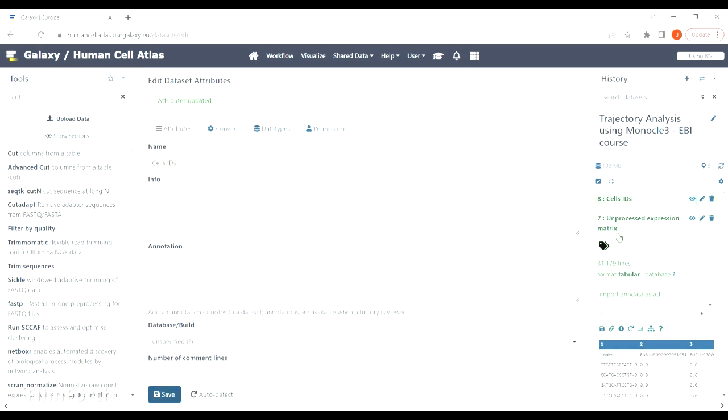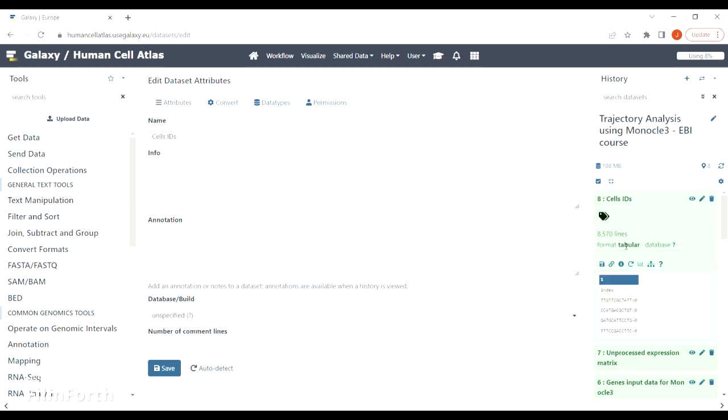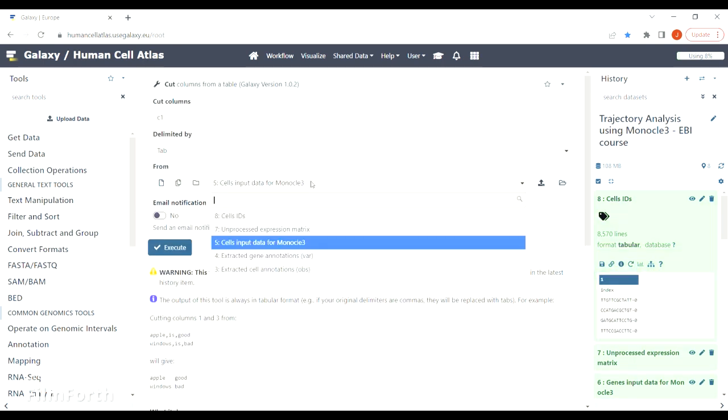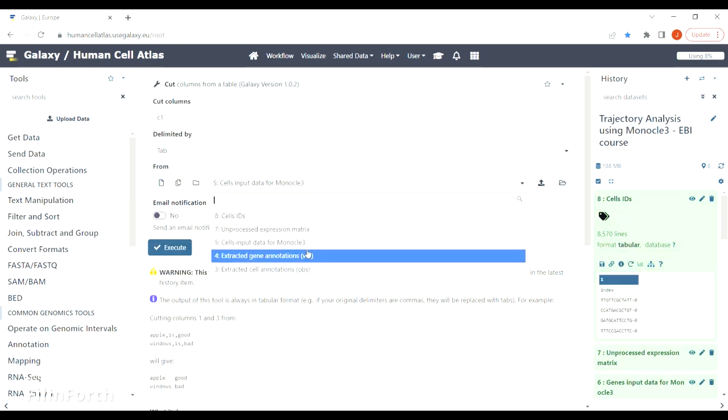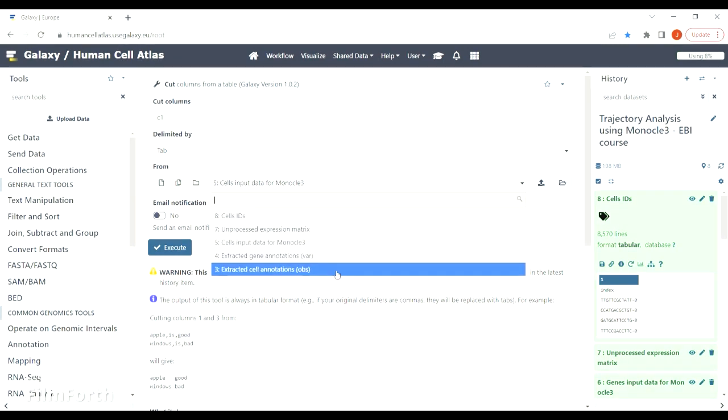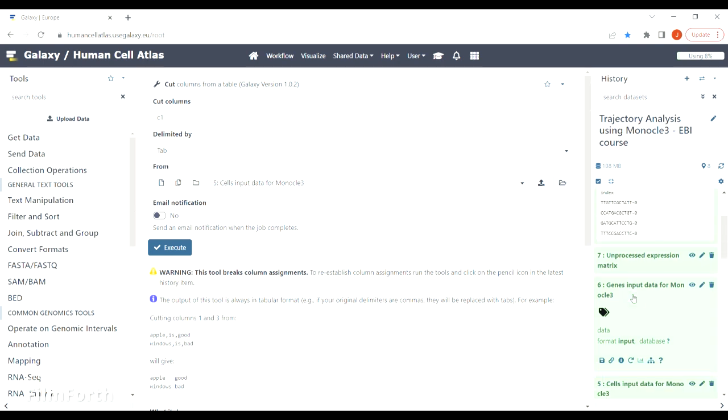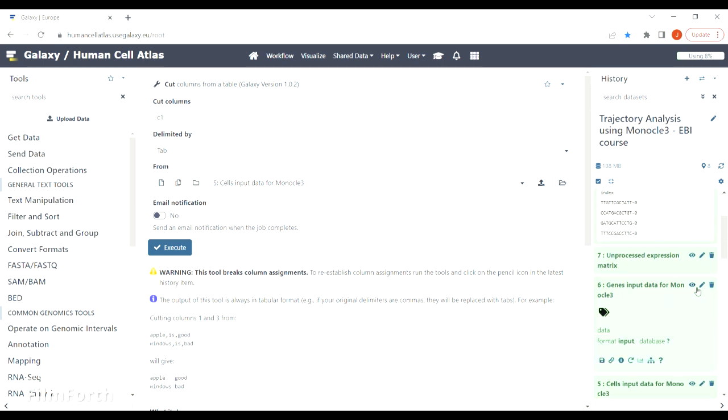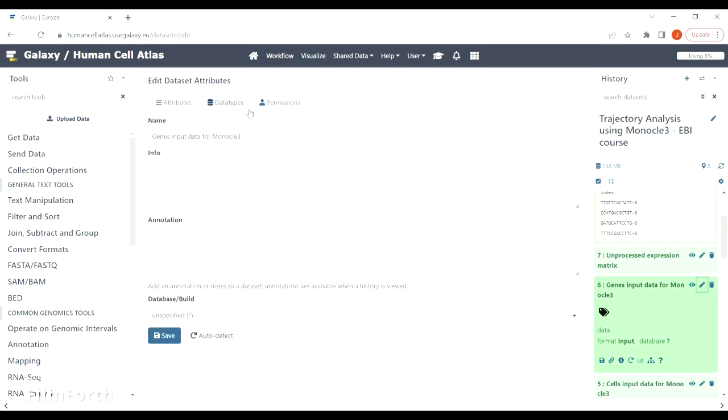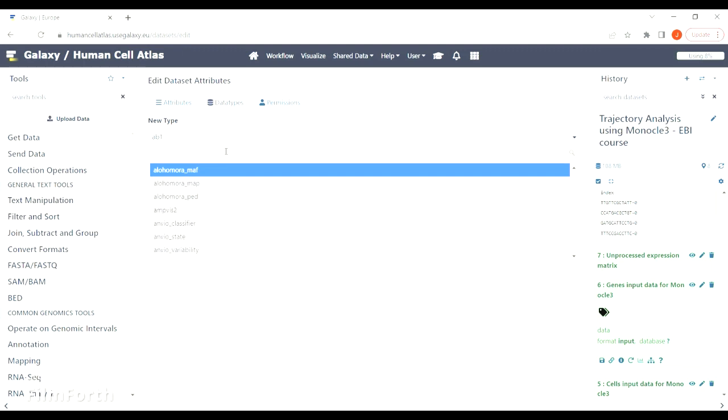Getting cells IDs went fine, but as you can see here Galaxy doesn't show the genes file that we want to get the genes IDs from. The reason for that may be incorrect format of the genes file. To change that, just go to this file, click on data types, and change the data type to tabular.